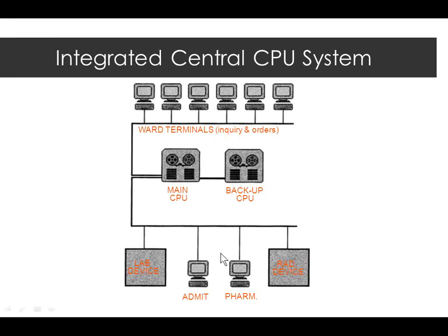The problem with this in the past was that there were probably better systems out for each of the individual services, like SunQuest, like a PACS system for radiology, than they had in any kind of centralized, standalone, one system feeds everybody system. So most labs and radiology wanted to get kind of best of breed. They wanted to have all the functionality for the lab or for radiology, and there really wasn't one system out here that could provide all of that.